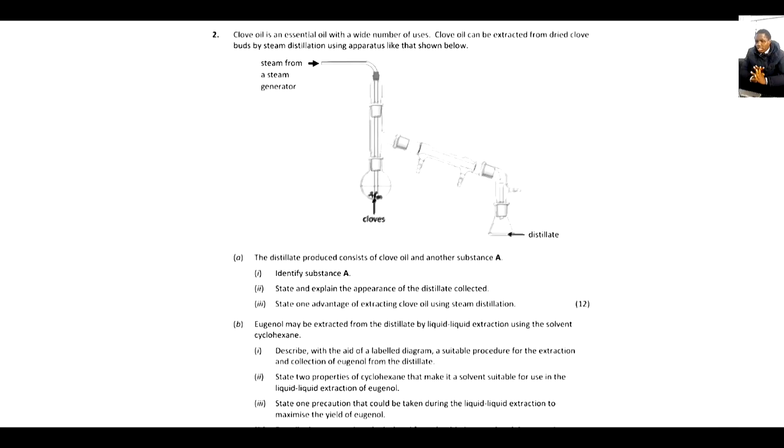Today we'll consider a question in chemistry, actually in chemistry practical. Today's question is on clove oil. What do you mean by clove oil? Clove oil, according to this question, is an essential oil with a wide number of uses.